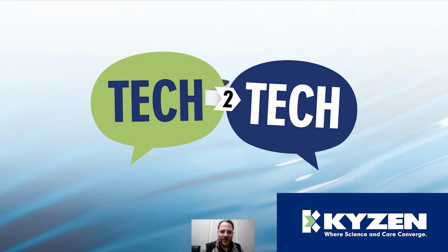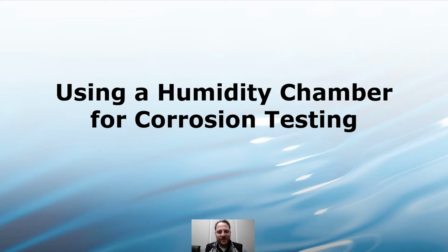Thank you, William. Hello, and welcome to today's Tech to Tech session. Today, we're going to be discussing using a humidity chamber for corrosion testing or performing a corrosion study.